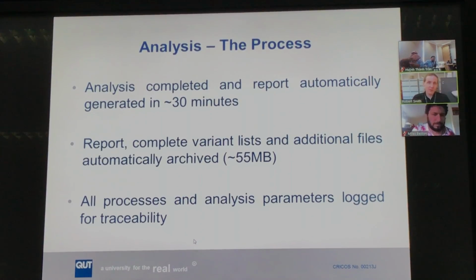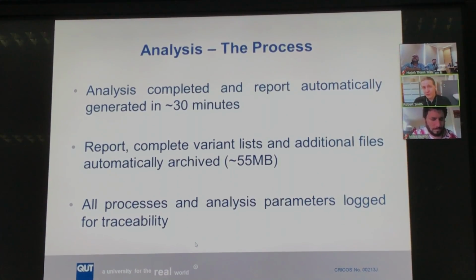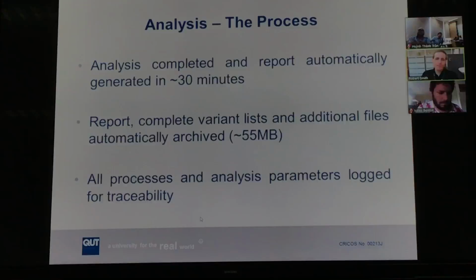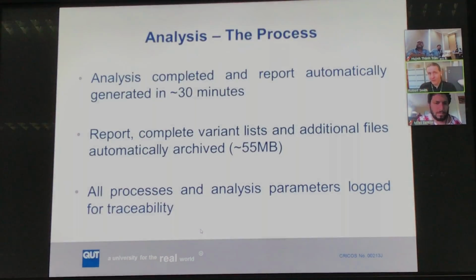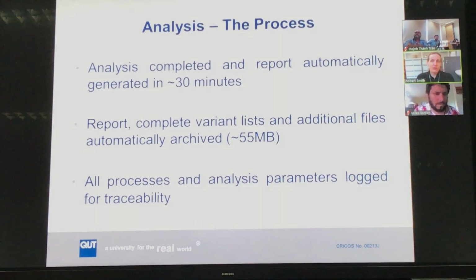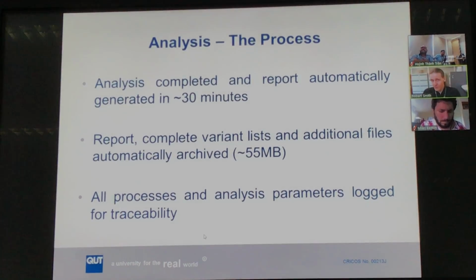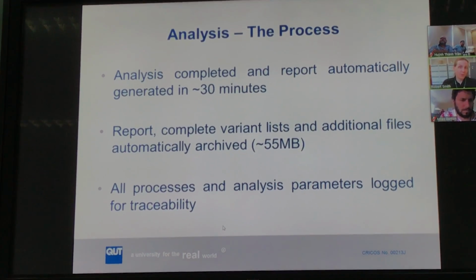If patients come back to us for information, particularly if there's new data that arrives from research or other sources, that might mean we need to recheck our analysis in the future. And all of these processes and analysis parameters are logged for traceability, so we know how it was analyzed, using what methods in the genome, using what versions of what programs and all that sort of thing, so that we can go back if there's been any problems and diagnose where that problem came from.